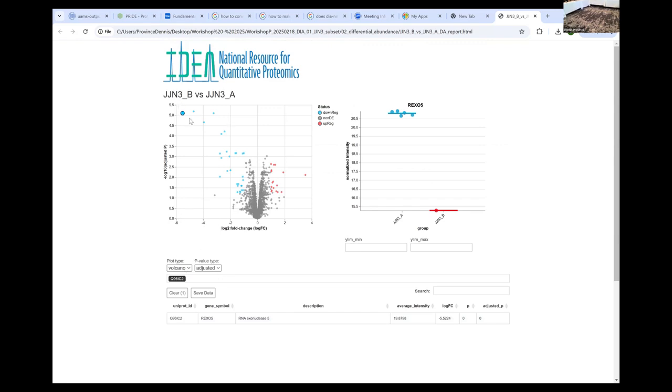So this is your volcano plot. And the idea, the strategy, as we tell people, is to find the candidates. So the candidates would be starting from these corners and sort of moving in. You would obviously pick off the low-hanging fruits, all of these guys that are in red or blue. But there may be some other ones in here that are right along that line. You can see there's kind of an invisible line here, and there's some of these guys that are just on the other side of it that might be part of your biology that you're looking for.